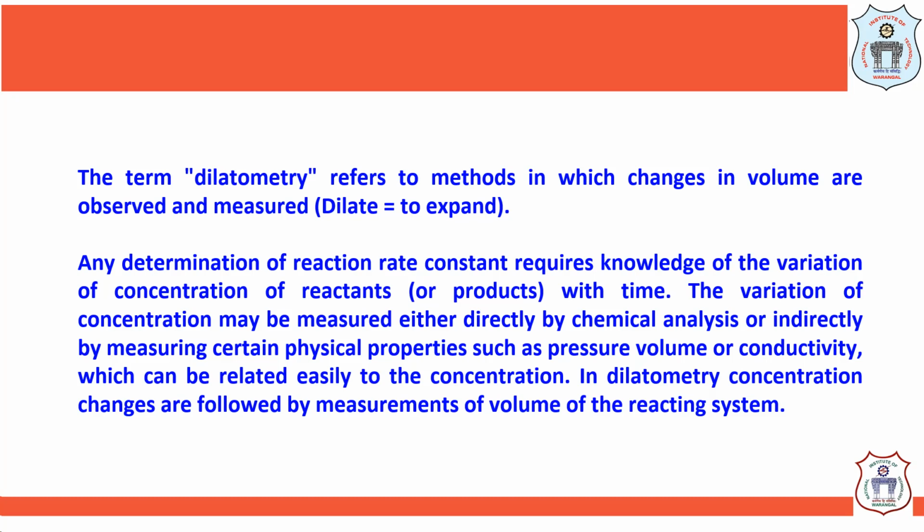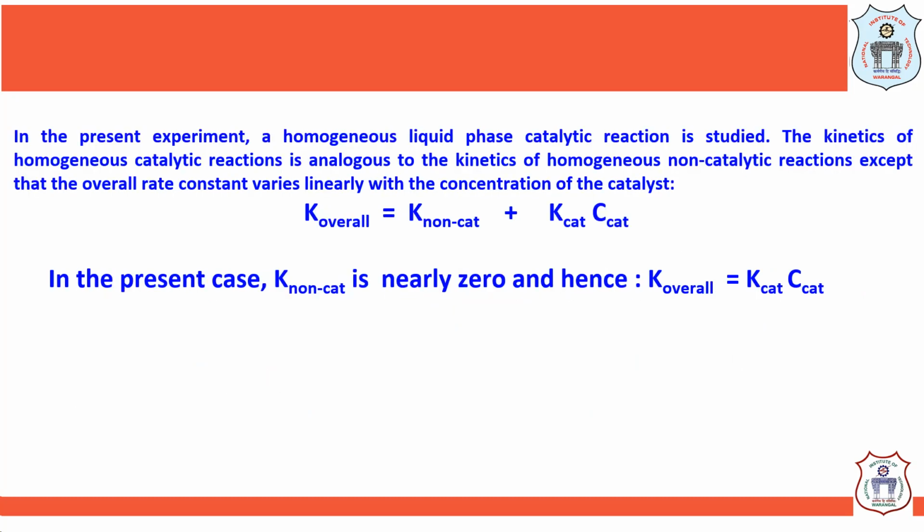In the current experiment, a homogeneous liquid phase catalytic reaction is studied. The kinetics of the homogeneous catalytic reaction is analogous to the kinetics of homogeneous non-catalytic reactions, except that the overall rate constant varies linearly with the concentration of the catalyst.